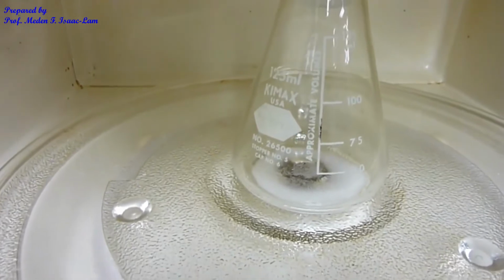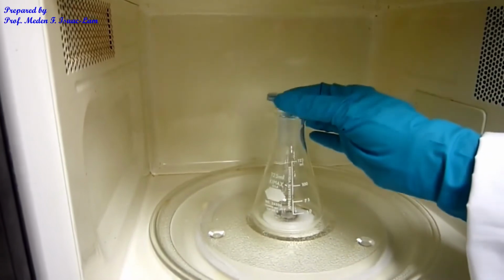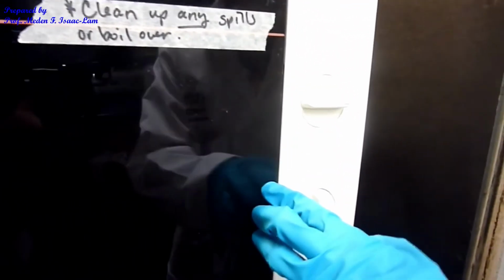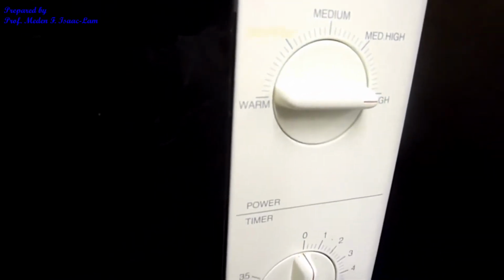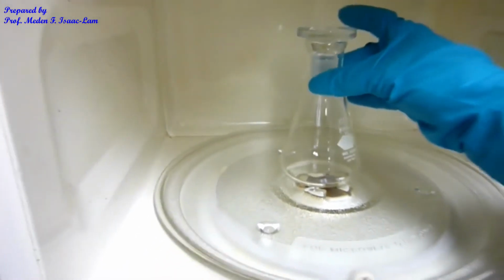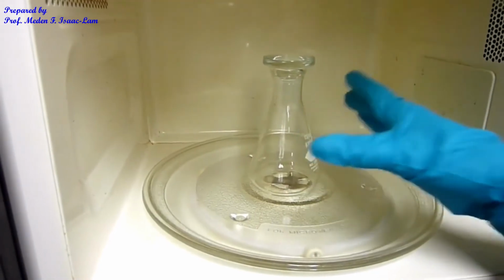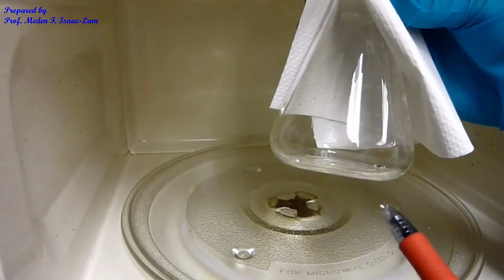I have the sample now inside the microwave, so I have it covered. And then I'm gonna close the microwave. So this is just an ordinary household microwave, and I set it on high, and then I'm gonna time it to 3 minutes. So the salicylic acid, after 3 minutes of microwaving, it's actually hot right now. It completely melted. So it's just the acetic anhydride and salicylic acid.